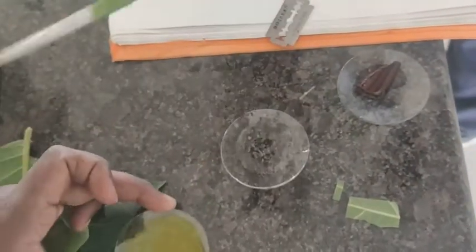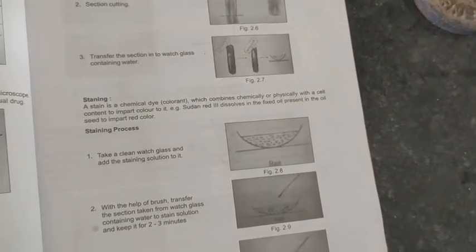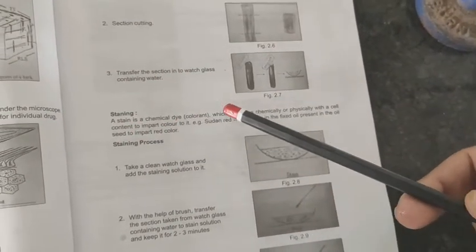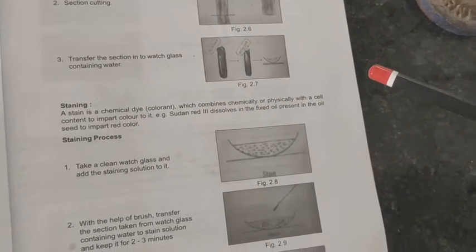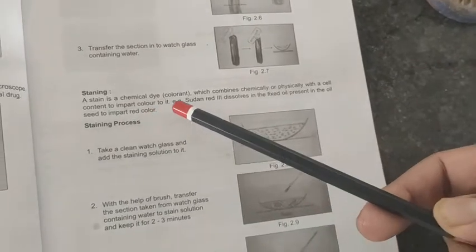Next is your procedure, staining. What is meant by staining? First, all of you know what is meant by staining. A stain is a chemical dye or colorant which combines physically or chemically with a cell to impart color to it.